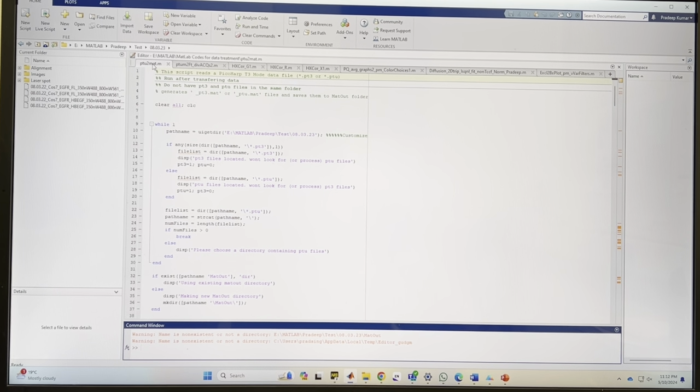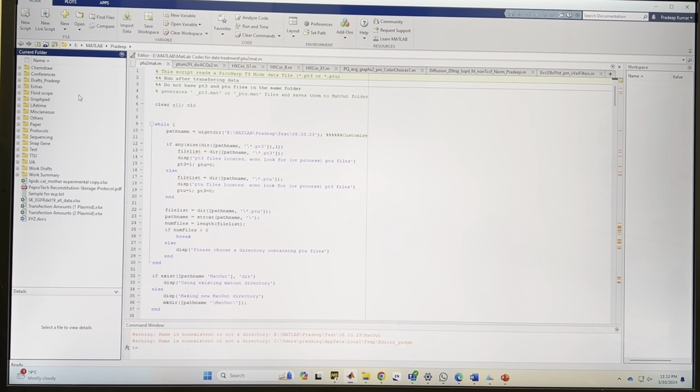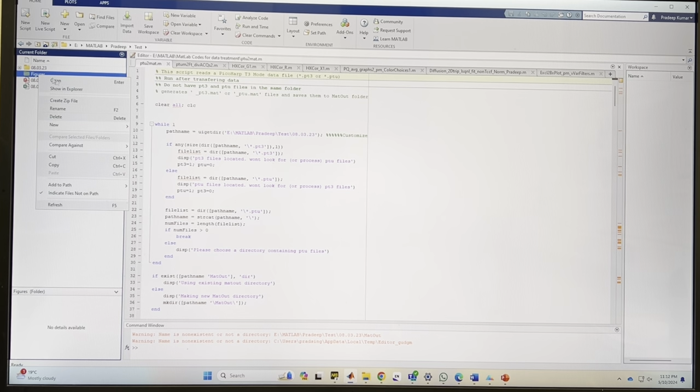So first, when you record data, you have one folder. You must have a folder which you can access. Like that I have prepared my name folder, and then whatever I need I can go to. Today is just a test, so I have a few readings here, and then I'll go to that folder. If it's not visible, you can add it to path with selected folder and subfolders, but this will come later.